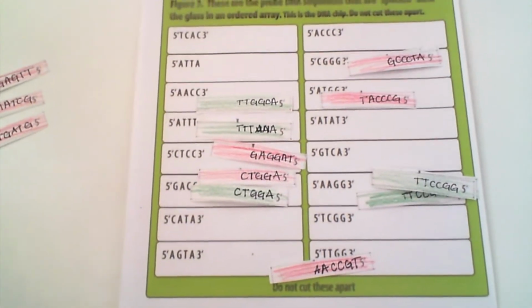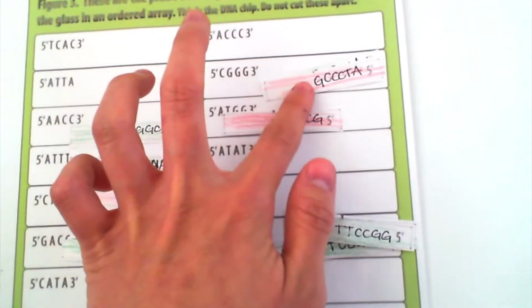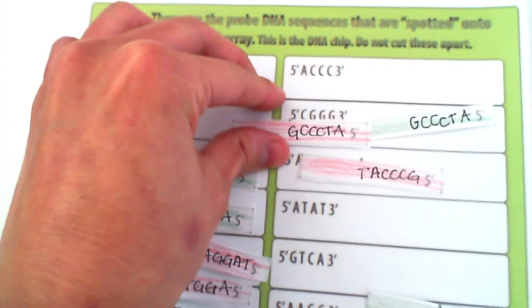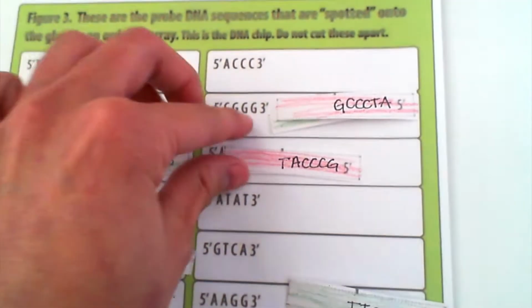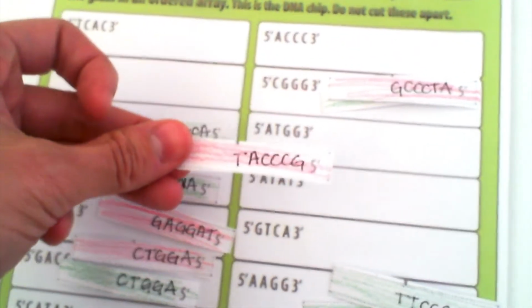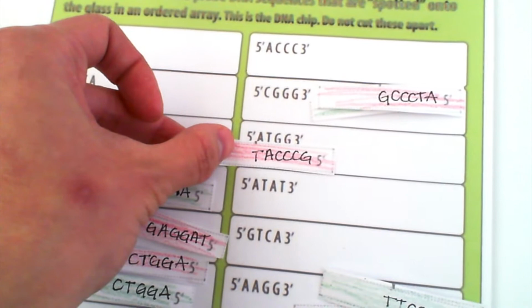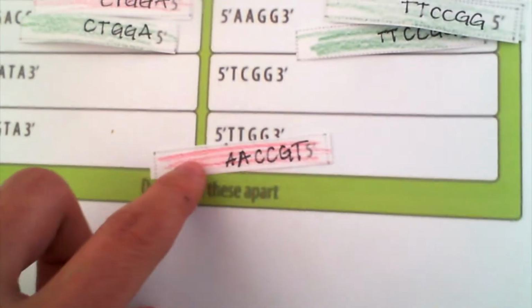So I went ahead and did the cDNA in correspondence to the plant that was grown in the dark. So I'm going to go over it. If you see in this one over here, this cDNA did correctly match to at least 4 base pairs to the DNA that was on the microarray. Notice that there is a normal green one with that one. And then we have this cDNA, which correctly matched to this DNA on the microarray chart. And then we have this gene down here, in which it correctly matched.